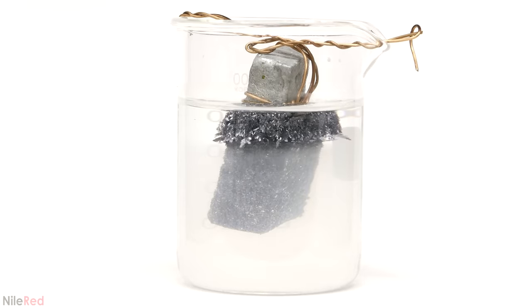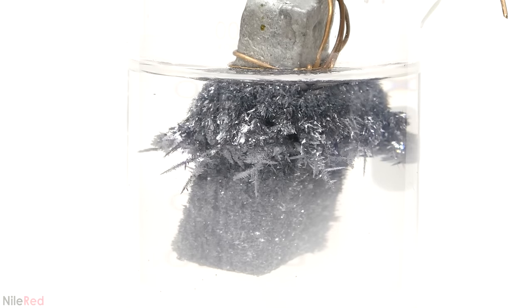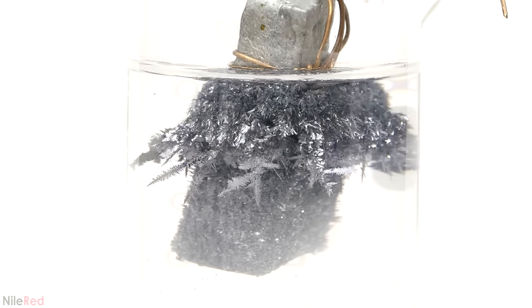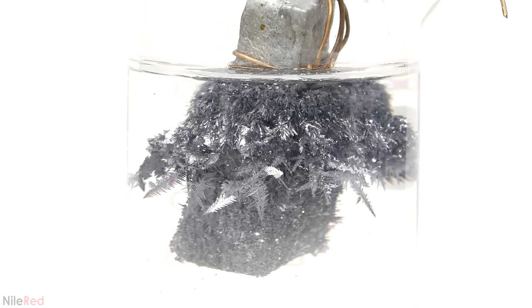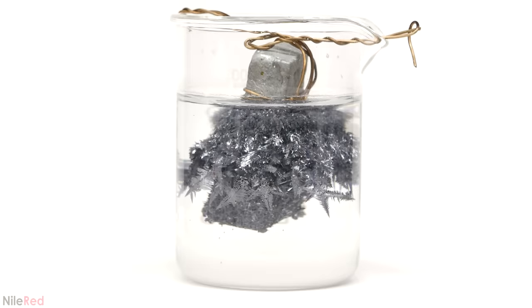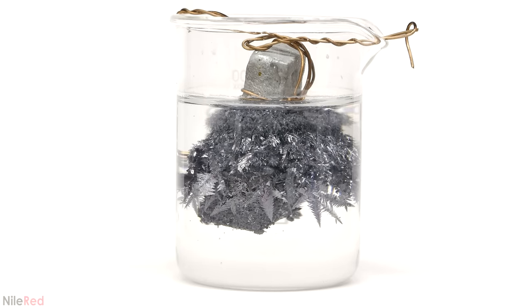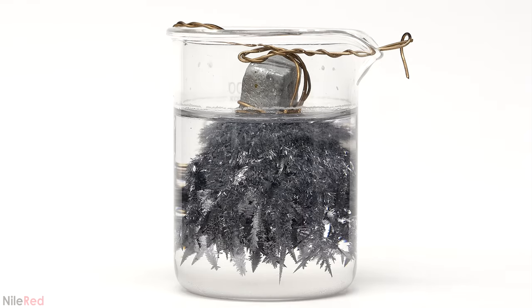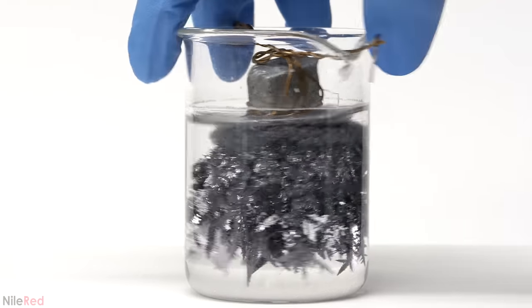I took a time lapse of the reaction over the following 12 hours. After the time lapse, I let it sit overnight, and this is what it looked like about 15 hours later.